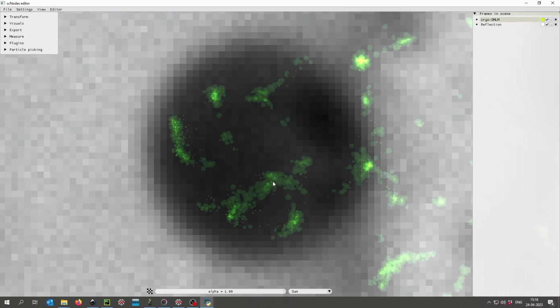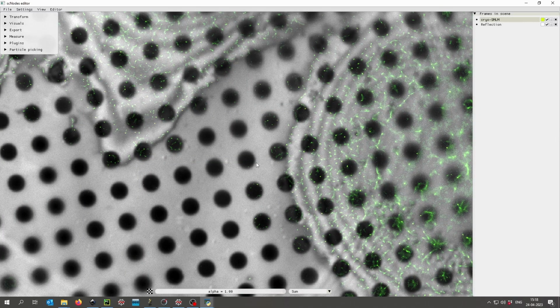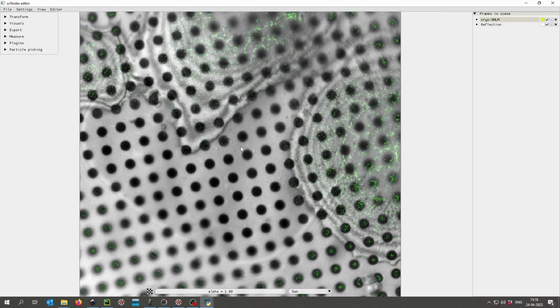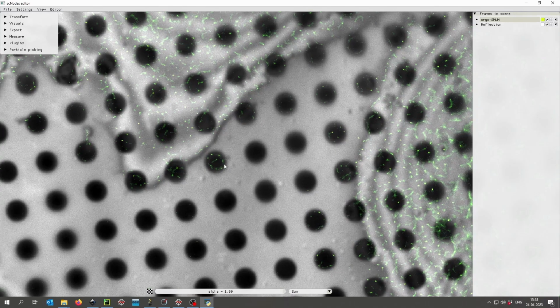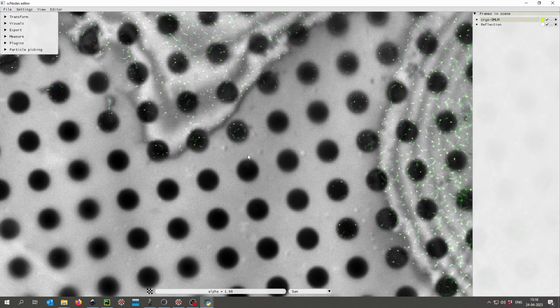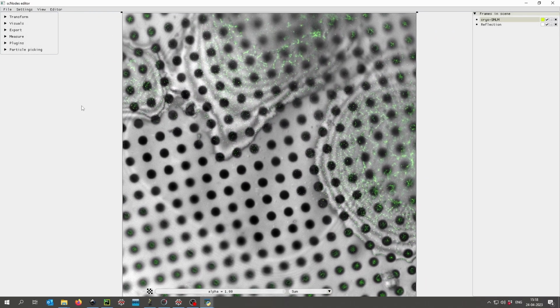So what I've done is taken this sample to the cryo-EM, I've tried to find the same location, and then I use a map like this one to target holes to acquire a tomogram in. I've acquired 5 tomograms for this square.